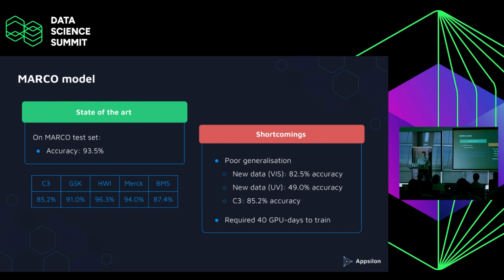I'm not sure we ran experiments on like 60. We've run experiments on the entire data set. So have everything we have, and let's compare it to fine-tuning. We've fine-tuned transformers, several of them actually, I think Swin and ViT. And we've fine-tuned ConvNeXts, a few versions of ConvNeXts. The ConvNet for the 2020. Actually, it's a V2, but never mind. So yes, you can compare that, and LoRA beats it by far, especially in the low data size regime.